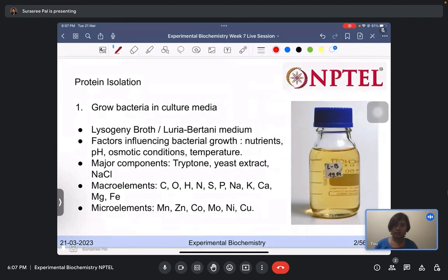So there are certain strategies which are taken. Also, there are certain bacterial strains which are used to optimize codon bias or to induce disulfide linkages in proteins, and several of these strains are used to overexpress our protein of interest.